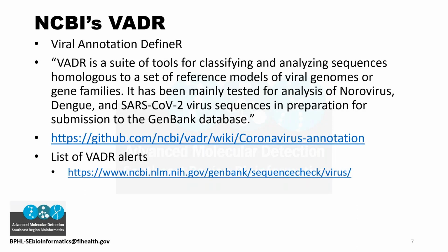So before I do a live demo of how to run that script on HyperGator, I'm just going to give you a little more information and provide some links regarding NCBI's Vader program so that you can look up more information yourself. Some of the more detailed information about different types of alerts you might get will be more relevant for the Part 5 training, which covers what to do when you get a flagged sample and how you can review it.